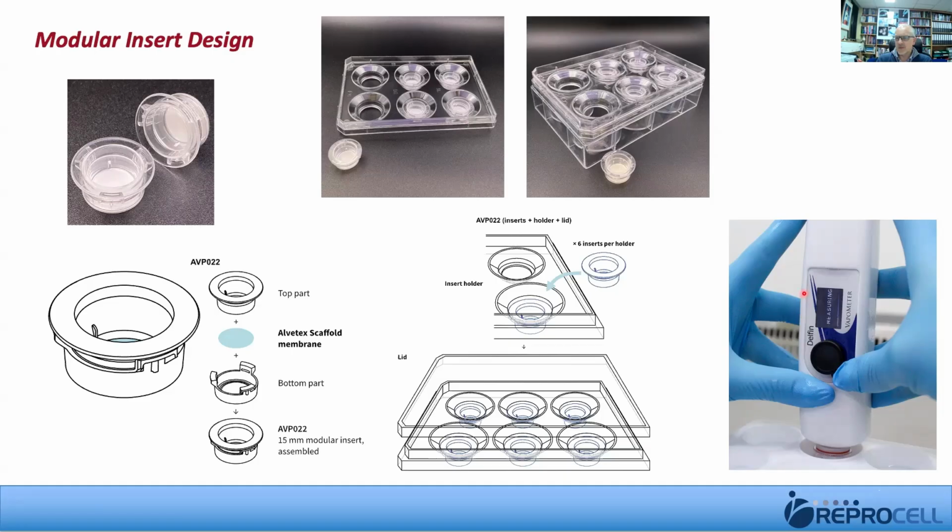So that device is an example of a measuring procedure which actually is also adapted in our model system. And there are other examples as well. There's specialized pH meters. There's also systems for measuring skin tone, which I also show later.